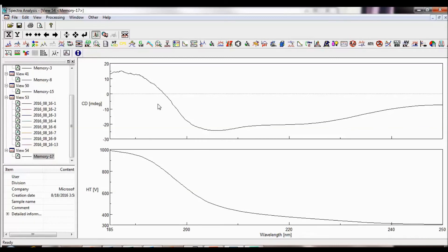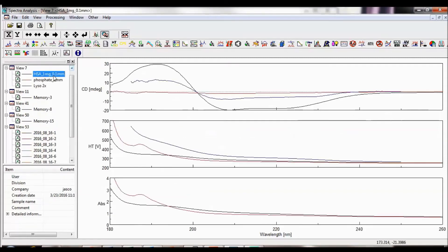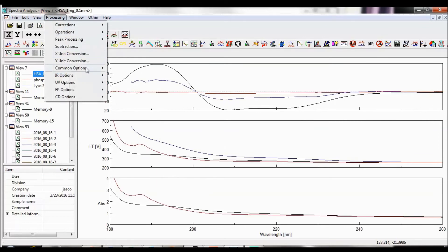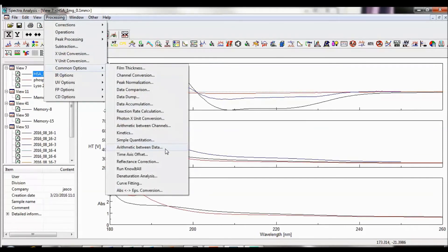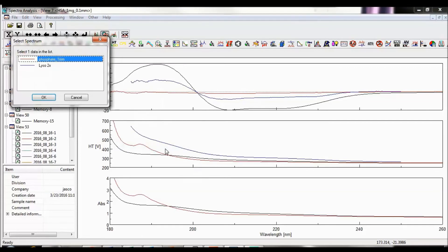The data modes, intervals, and measurement ranges must be identical to perform the data accumulation operation. Arithmetic between data performs an arithmetic operation between spectra overlaid in the same view, which have the same data modes and intervals. The difference between this operation and the arithmetic operation is that you can perform this function on more than one channel in a view, not just on channel 1.